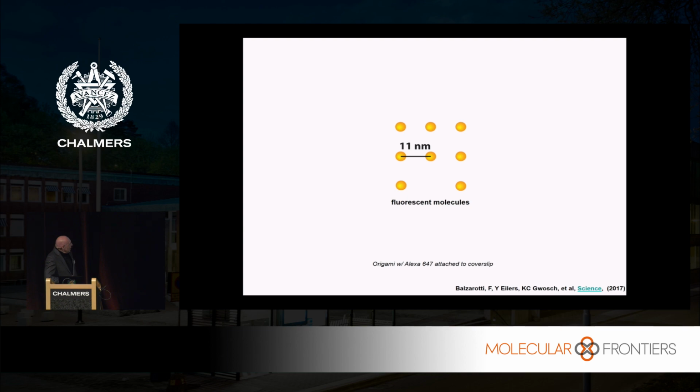Now, this is a cartoon showing fluorescent molecules at very small distances. You see here 11 nanometers or so.